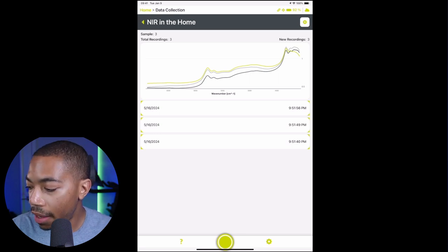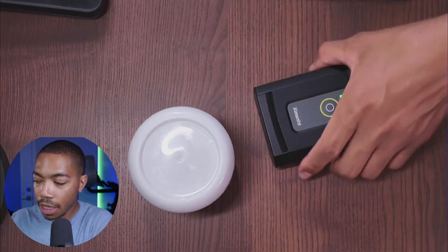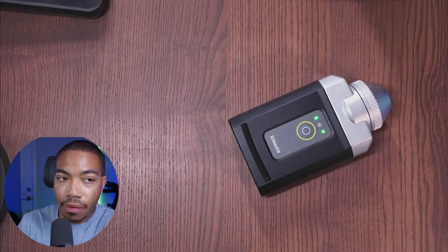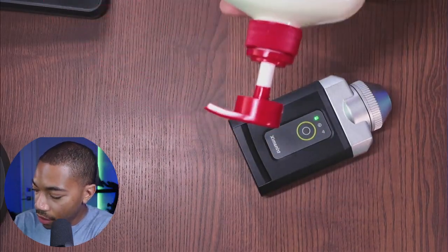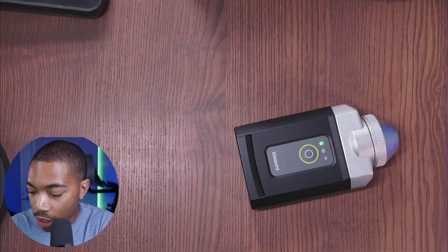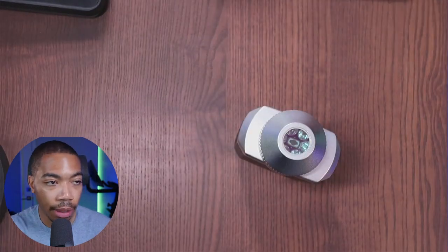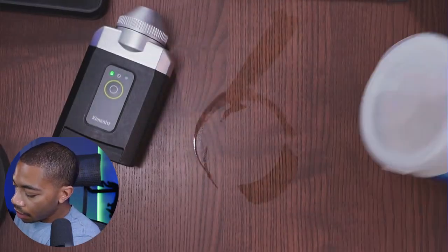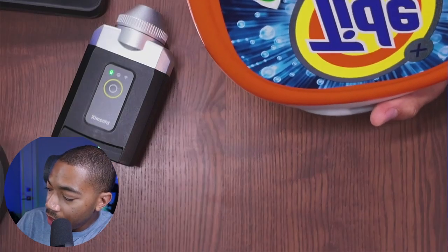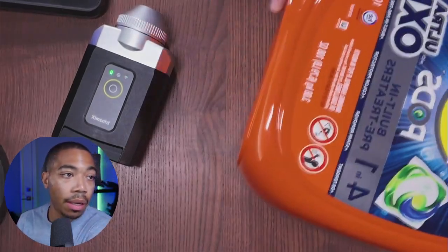So here we have polypropylene, and we'll take a few measurements like we did before. And just like that, we're ready to recycle it. Got another container. This is polyethylene. So let me mark that. And we have polypropylene, and we'll keep going. Whoops. Little mess. Desk a little cleaner. You've got another PETE.